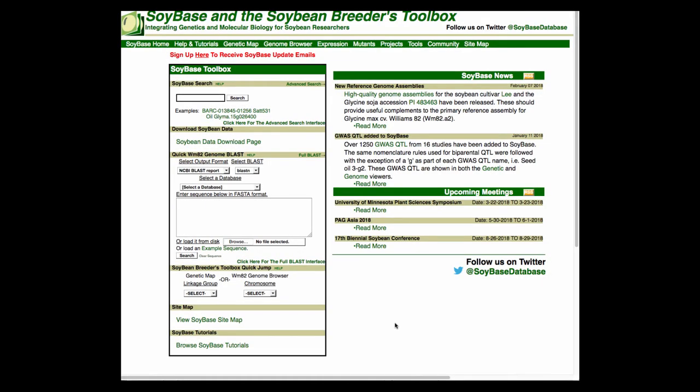Welcome to another SoyBase tutorial. In this tutorial, we will learn how to download the results of genotyping the entire soybean germplasm collection with the Soy50k SNP chip array.